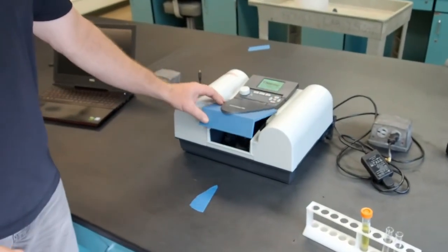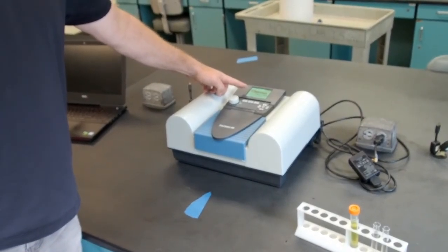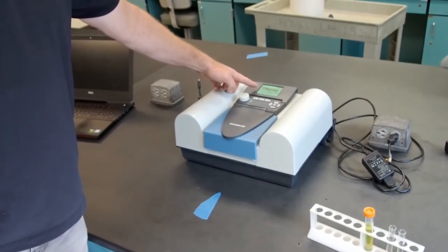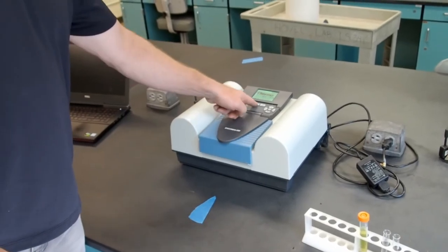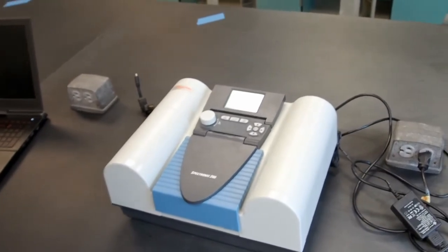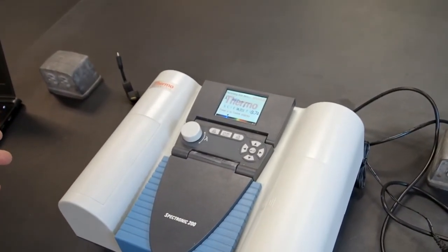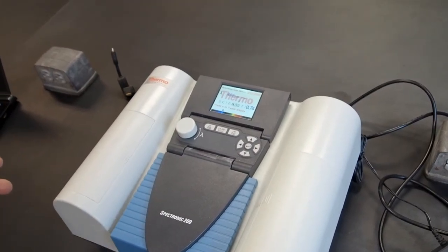We're going to close our cover. We've already set the wavelength to the first wavelength we want to read, which is 480 nanometers. And we're going to hit the 0 button. This is going to zero the spectrophotometer. In other words, it's going to say that 0 absorption is a blank full of acetone.